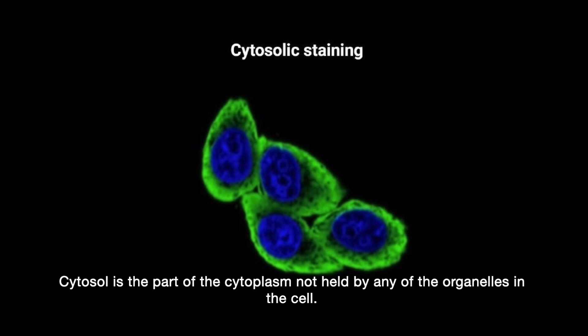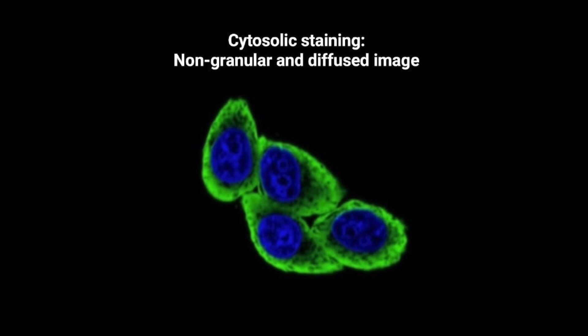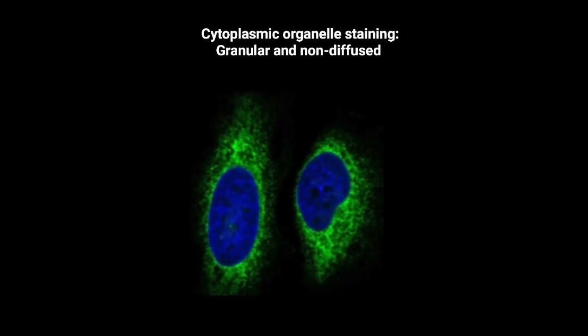It is actually the cytosol. The cytoplasm of a cell consists of both the cytosol and the organelles. Cytosol is the part of the cytoplasm not held by any of the organelles in the cell. Cytosol proteins are able to diffuse and distribute all over the cells, thus forming a non-granular and diffused image. On the other hand, cytoplasmic organelle staining is usually granular and non-diffused like this, as proteins in organelles are not able to freely diffuse all over the cell, thus forming a granular image.